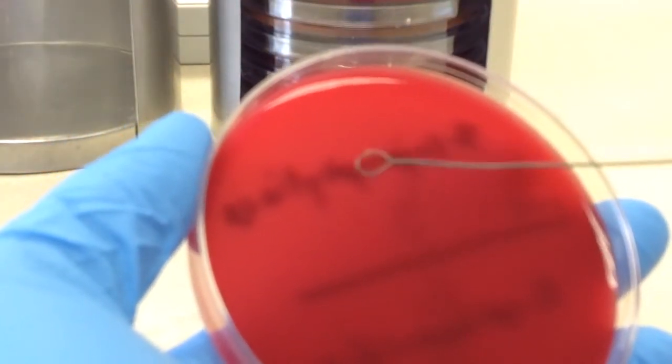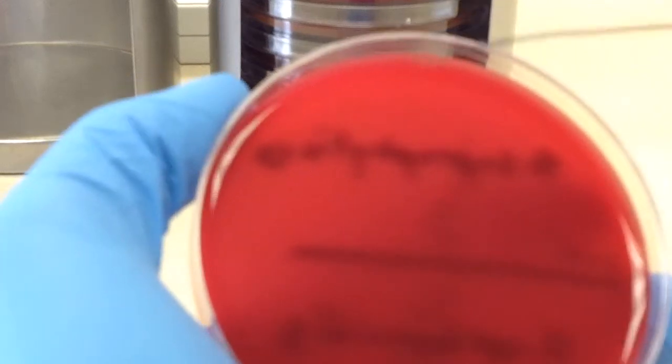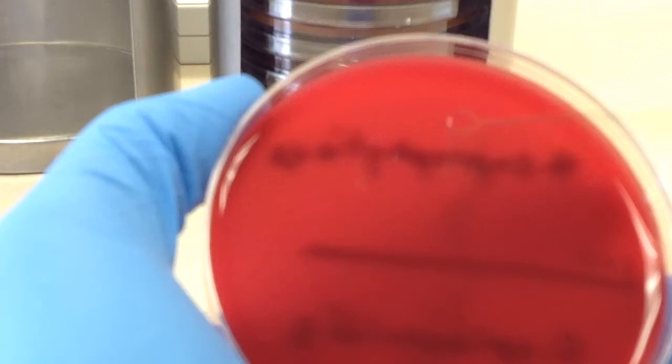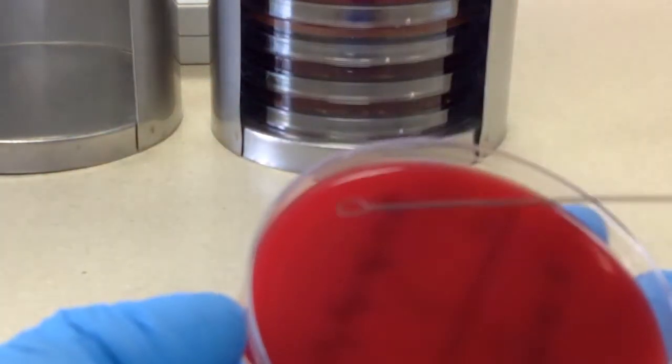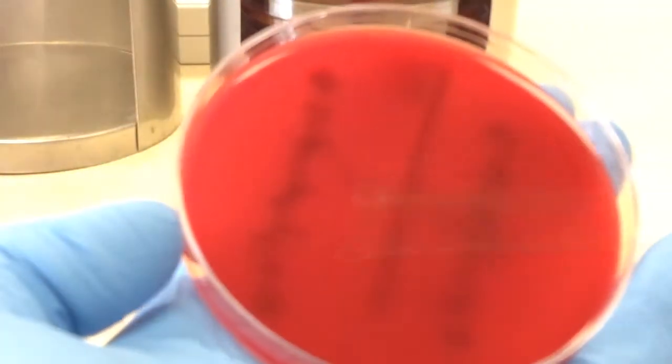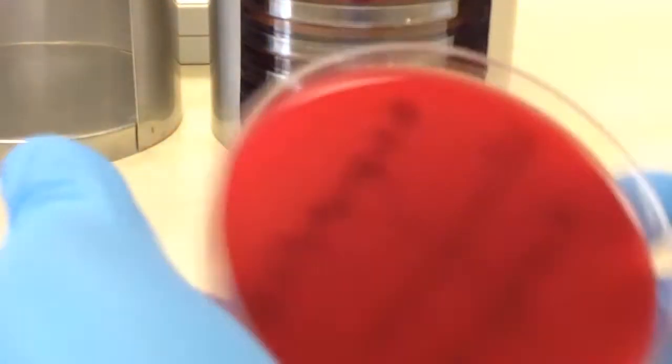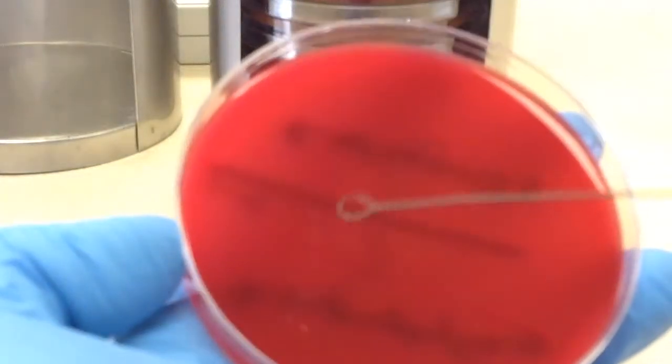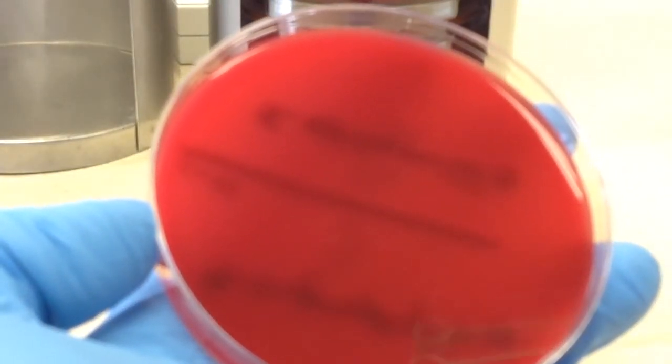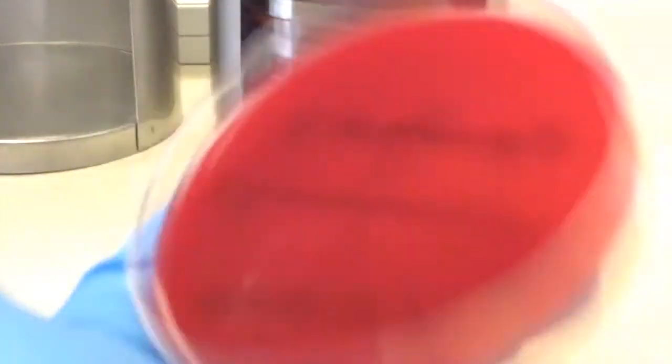I'm just simply going to put the organism onto the plate and then streak back and forth until I have a square that should have organism evenly distributed onto it.